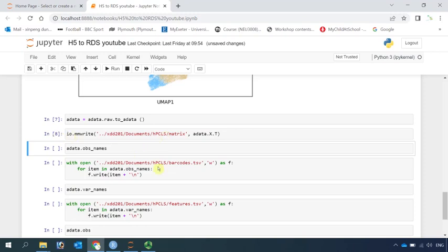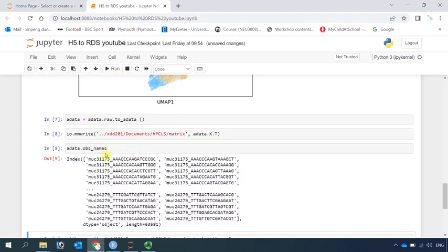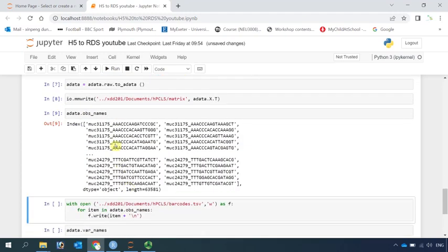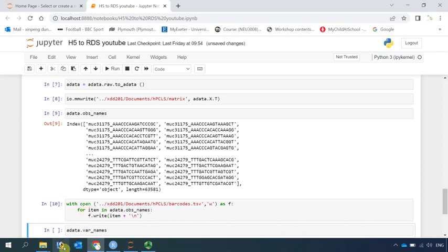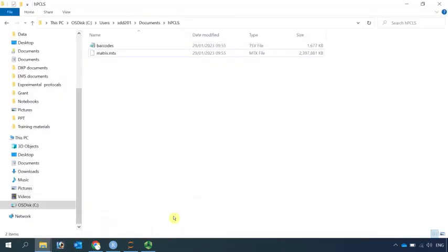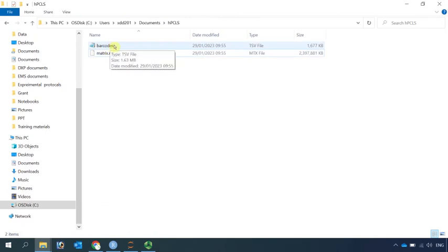Next, we can write the barcode information. The barcode was saved in the AnnData observation names. You can see the barcodes here. So the observation names are barcodes, and we can write this information as the barcode file. If we go to our folder, you can see we have the matrix data already, and now we have the barcode information.